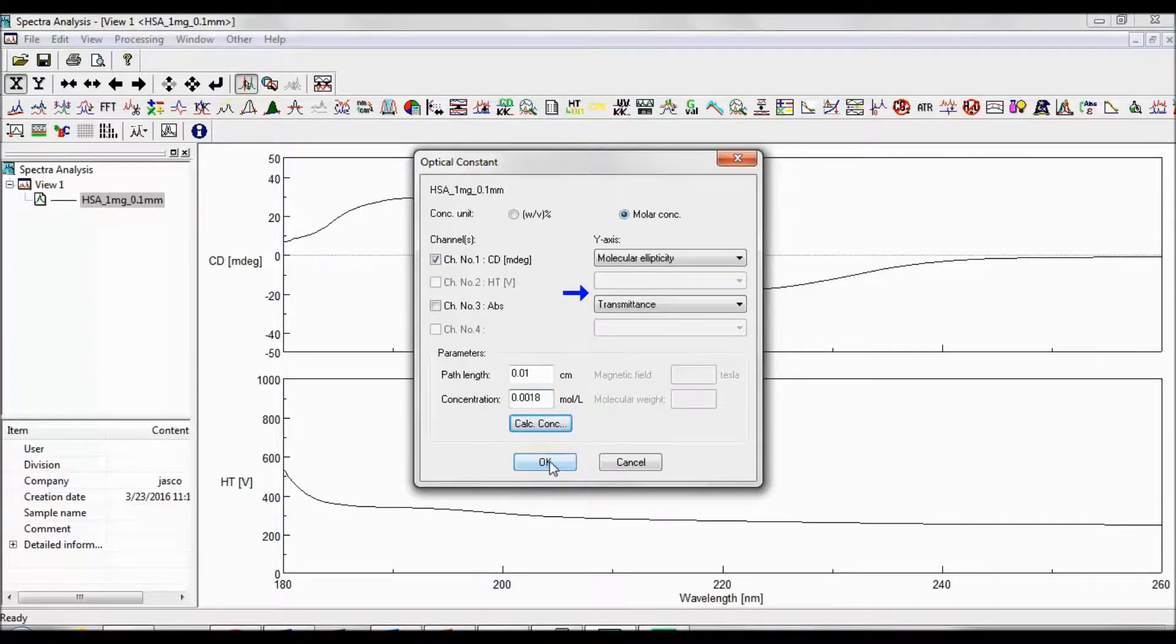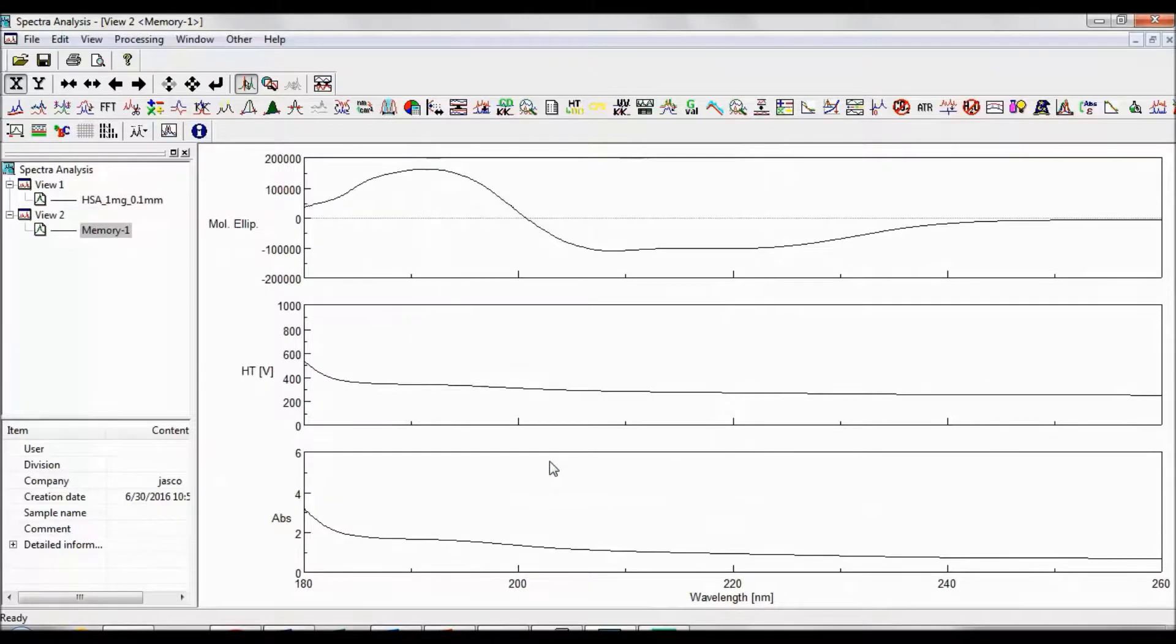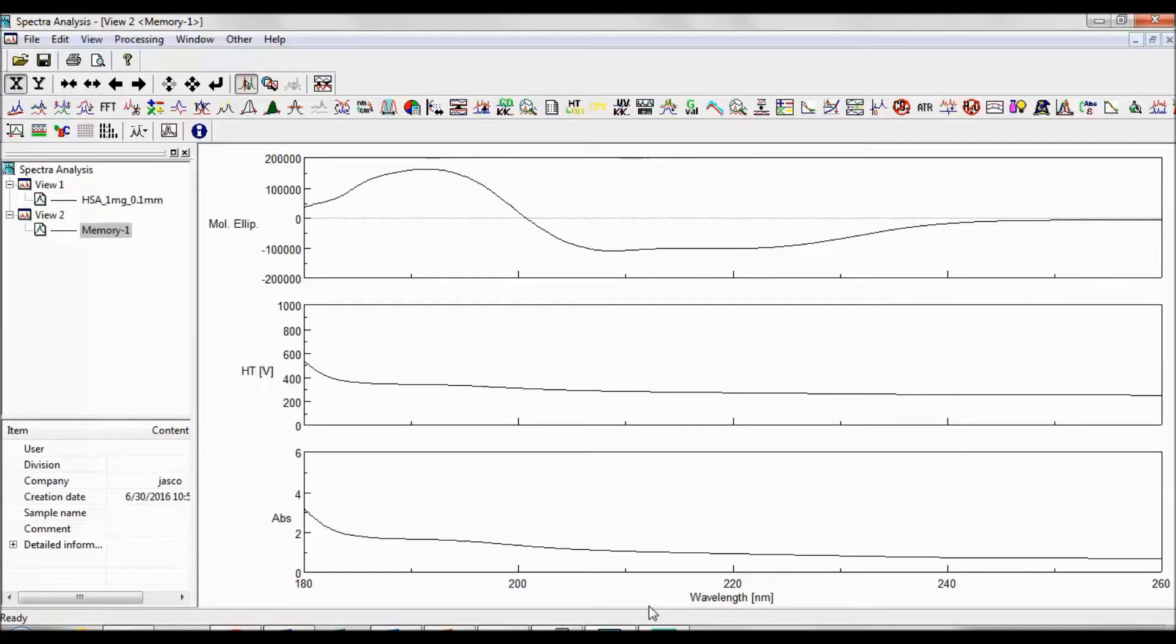After clicking OK, you now have created a new memory with your raw CD sample spectrum in units of molar ellipticity.